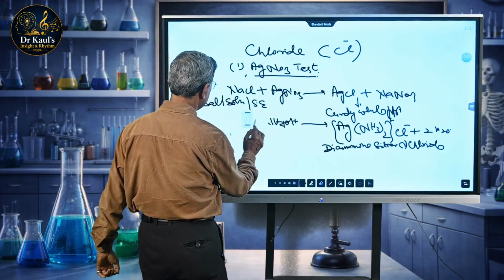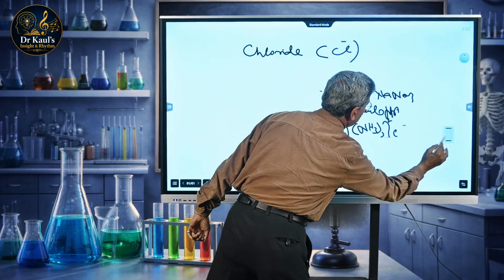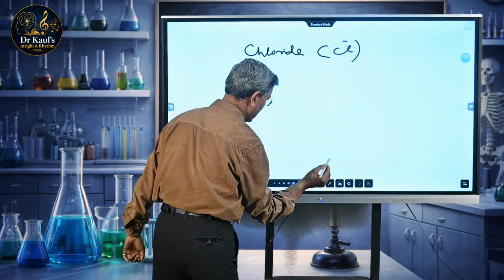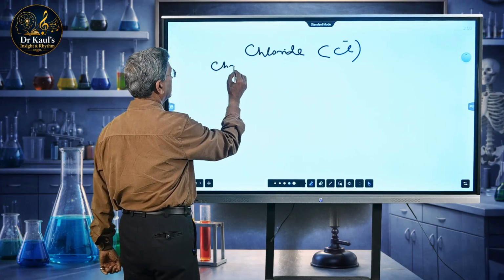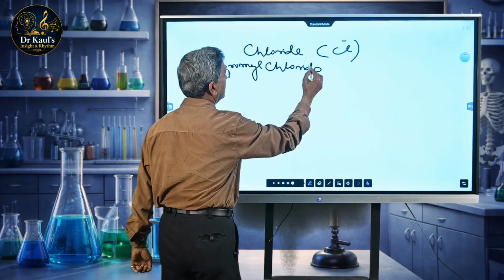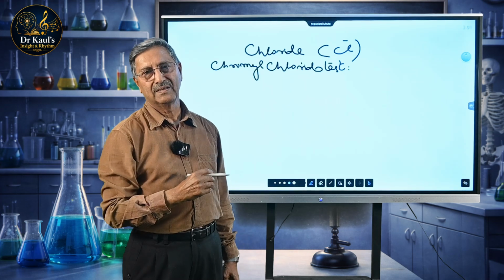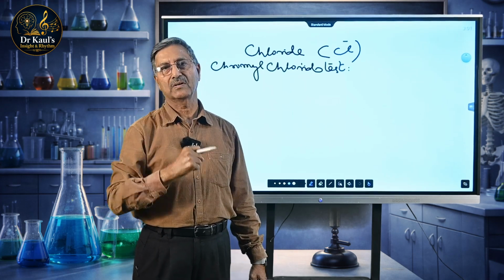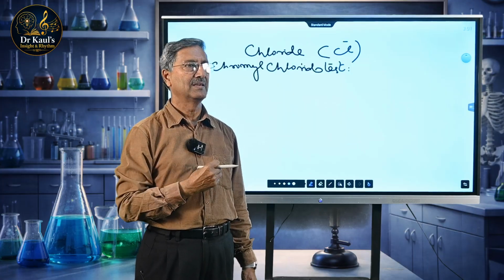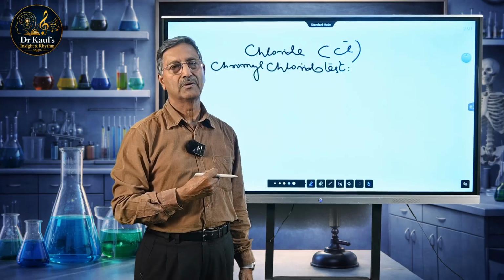Now the second test in this series is the chromyl chloride test. This test needs precision and attention of the performer, maybe student or maybe teachers. Sometimes it happens that this test is not properly performed and we don't get the desired results.